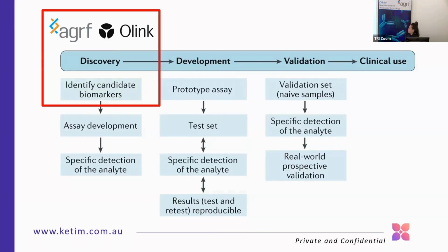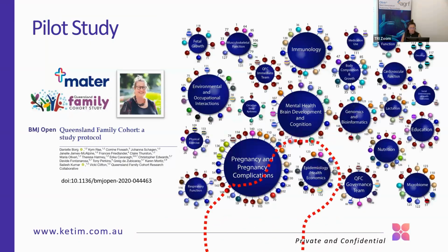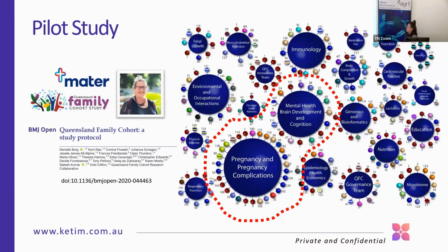Now, I'm literally at the first stage now, where I looked at Olink technology, the Explore HD, in collaboration with AGRF to identify these candidate biomarkers. And really, I just want to quickly touch on this as well, because if it's not for MADA research, as well as Vicky Clifton here, as you can see, none of this work would be here today.